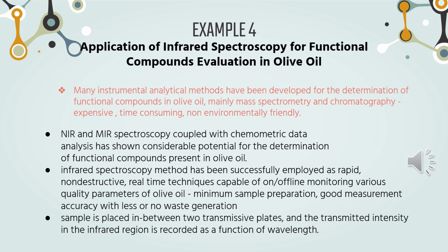However, these methods are expensive, time-consuming, and non-environmentally friendly. Near-infrared spectroscopy and mid-infrared spectroscopy, coupled with chemometric data analysis, have shown considerable potential for the determination of functional compounds present in olive oil.